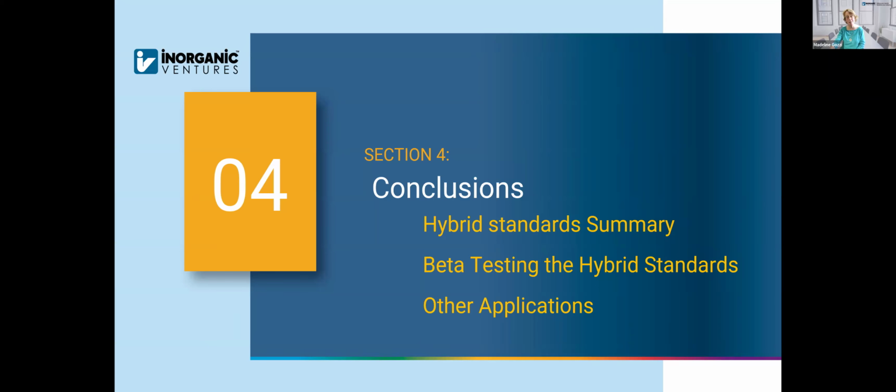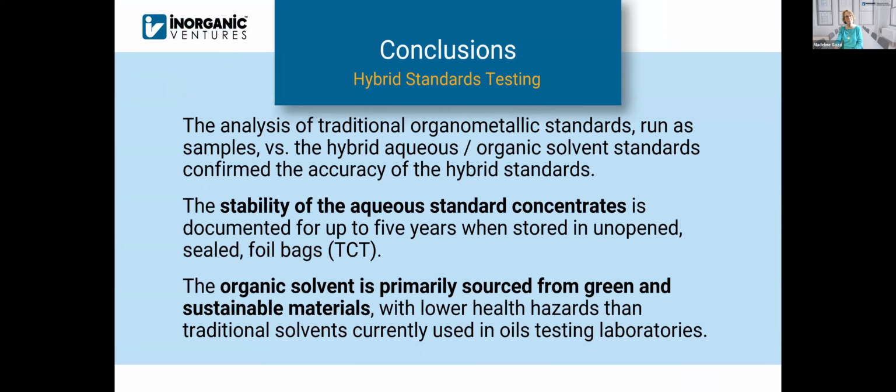So what conclusions did we draw from our testing? And we'll talk a little bit about beta testing the hybrid standards and other applications. So the analysis of the traditional organometallic CRMs versus our hybrid aqueous organic solvent standards confirmed the accuracy of those hybrid standards.